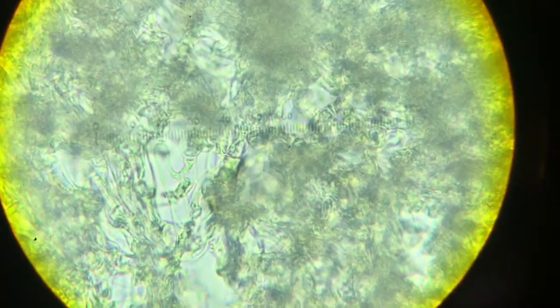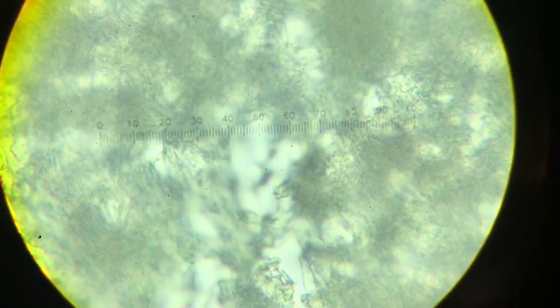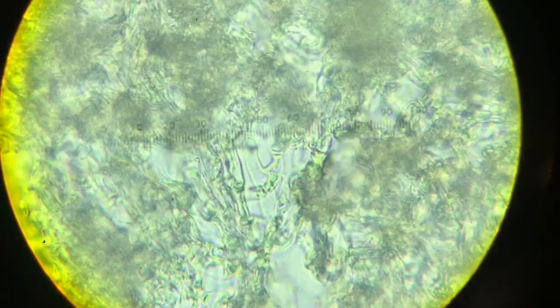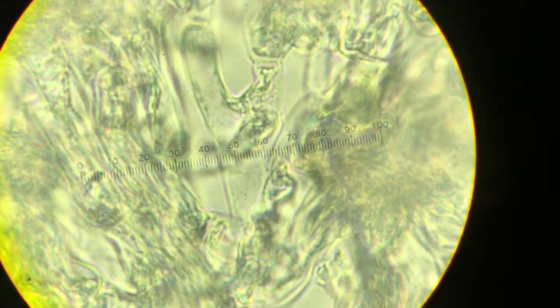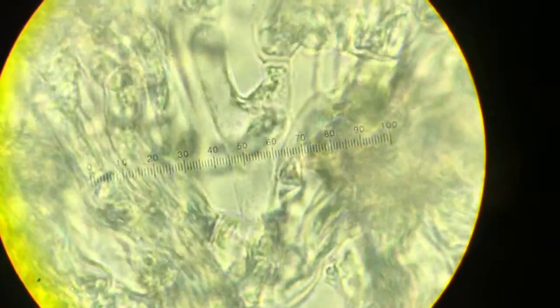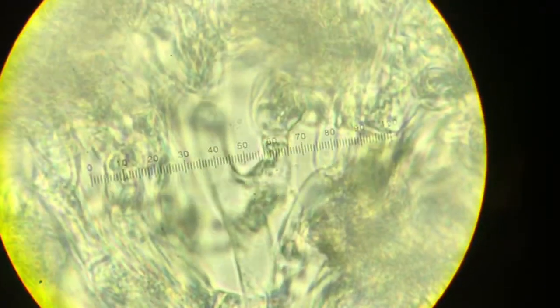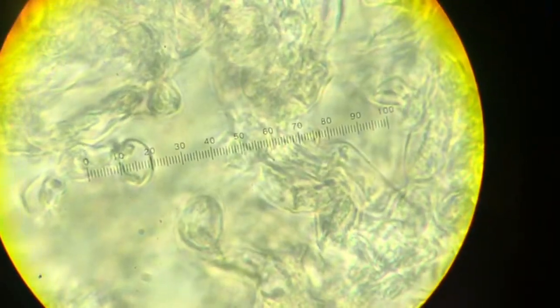And when you increase magnification, what I want to show you is sort of in the middle, where number 50 is, between 40 and 60. You can see that the structure of the hyphae is very clear here. So this is that branched structure that I had before, but this is now an oil immersion. And you can see that these are somewhat vertical. But just get a feel for the orientation, the types of cells, what you see.